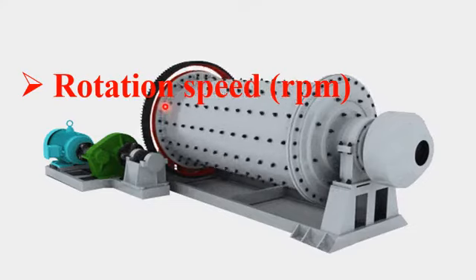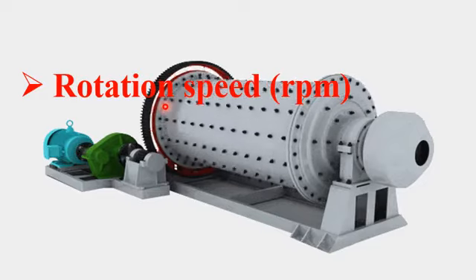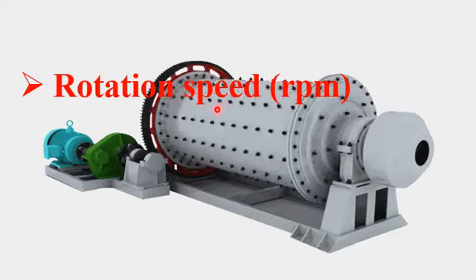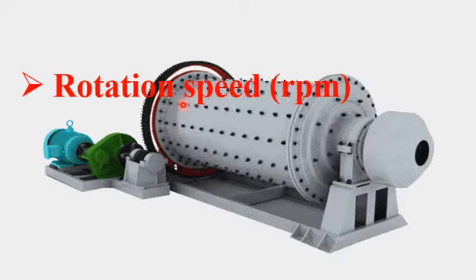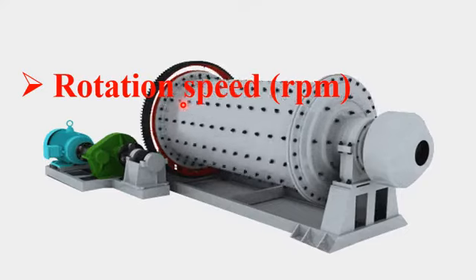Okay, so dear student, please note that the ball mill apparatus will depend on the diameter of the ball, and also on the size of the inside part or the hollow region of the ball mill apparatus, and also on the size of the bulk material which you want to crush.